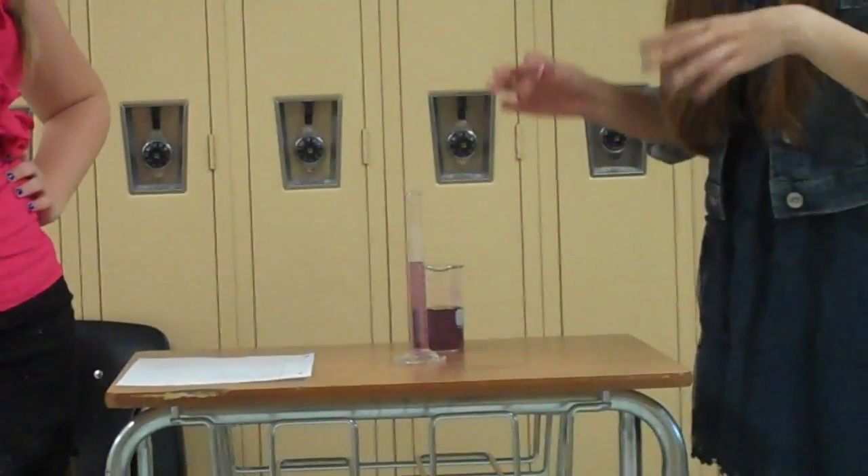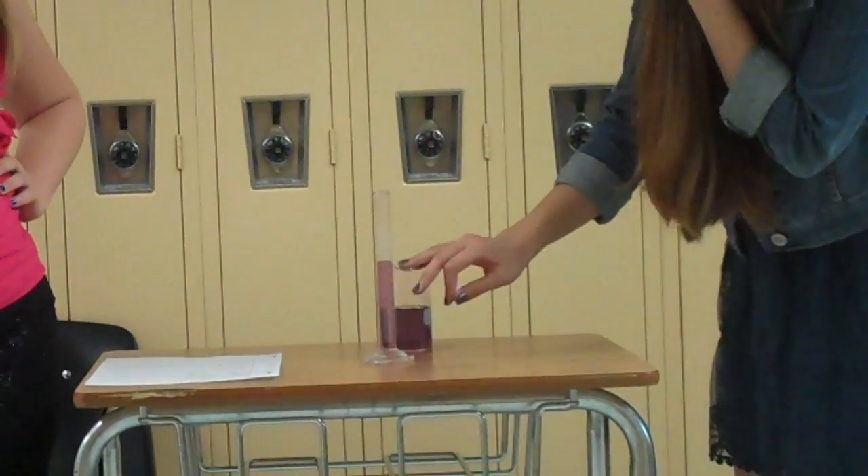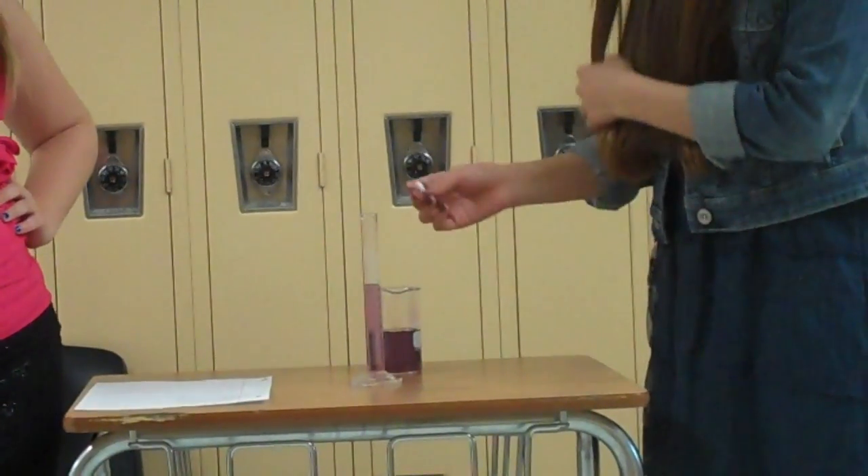The meniscus is almost like a little bubble on the top, and it curves the water down. So you have to read the line underneath it to get the correct measurement.